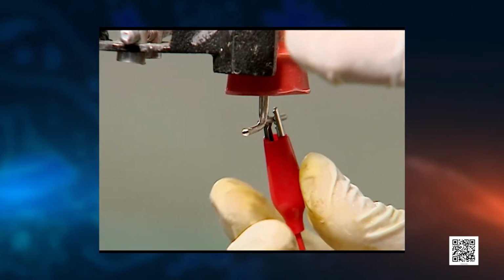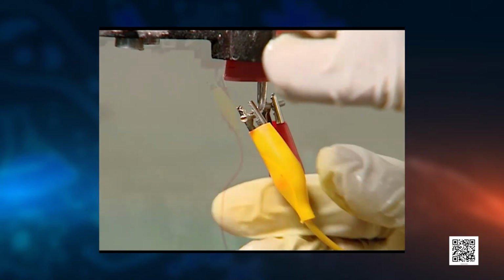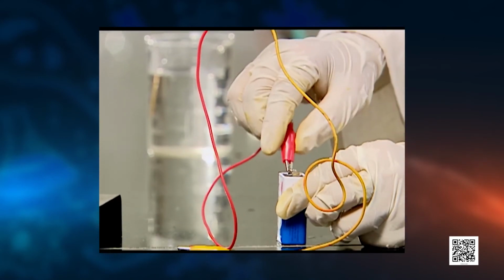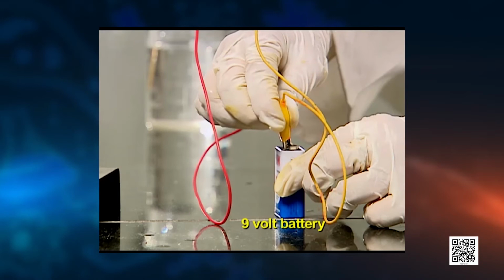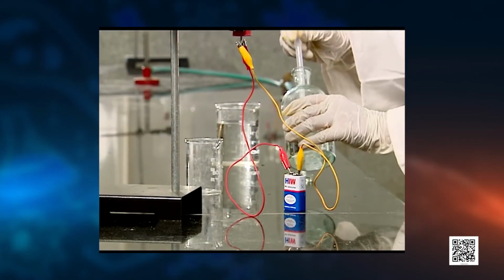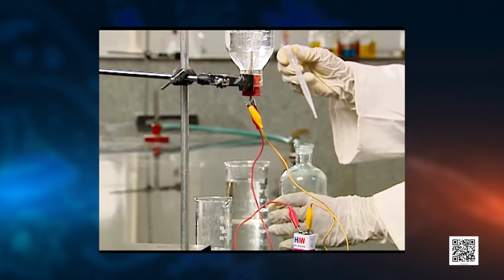And now the crocodile clip is attached to the 9-volt battery. Remember, this is decomposition using electricity. So water will decompose by passing electricity. A few drops of dilute sulfuric acid are being added to the water so that the reaction becomes fast.